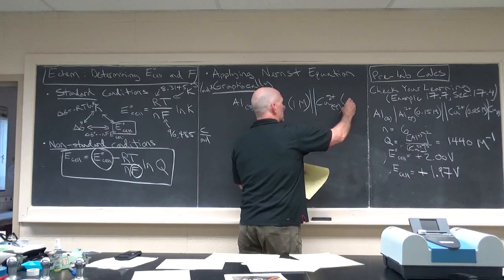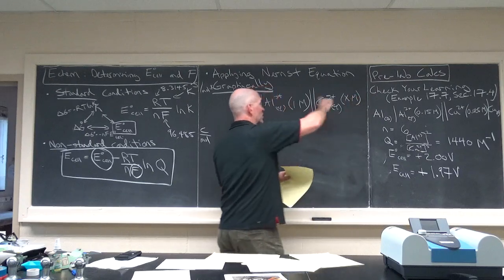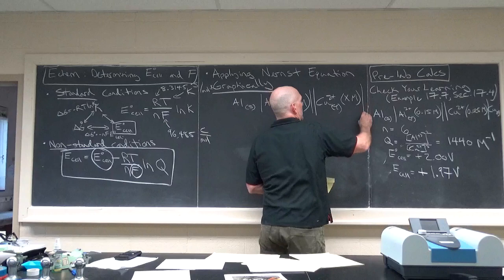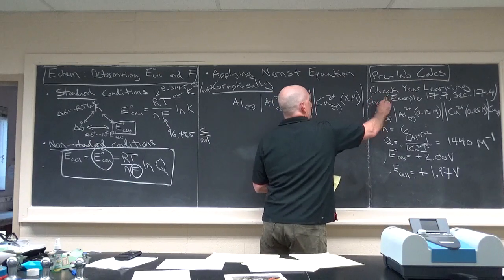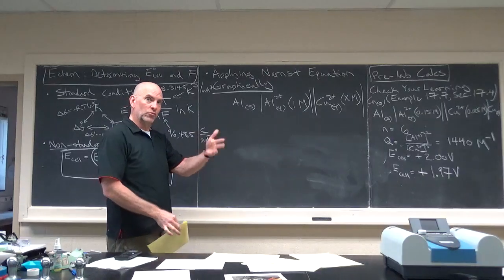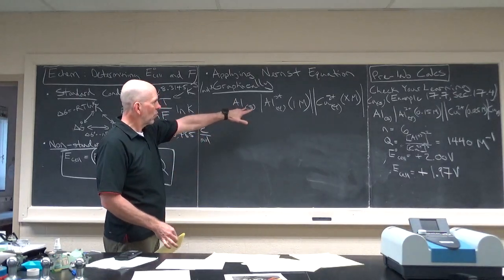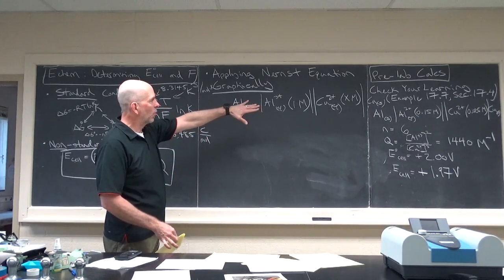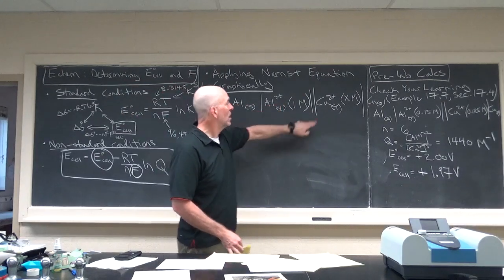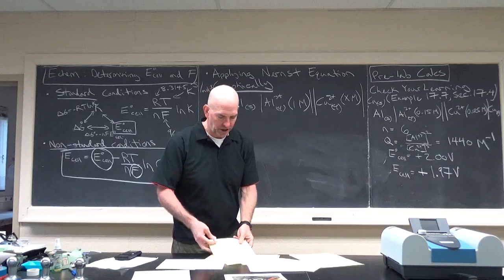this is not the way the lab is written. We're going to vary the concentration of the other ion. Really messy here, sorry. So that's how the experiment is set up when you read the pre-lab. You're going to hold one at 1 molar, the other one we're going to have variable. So this will be standard concentration for one of them, non-standard concentration for the other one.